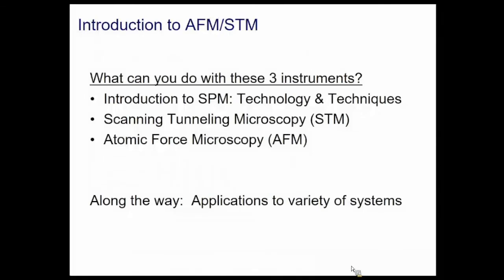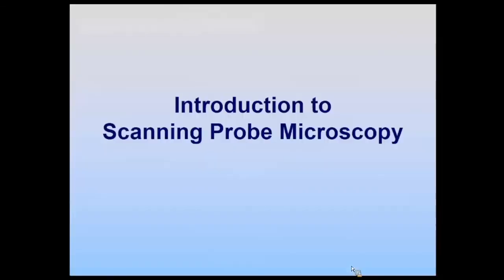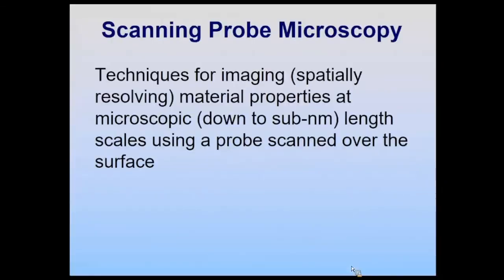For this talk, what I'm going to talk about is what you can do with these types of instruments. I'll start with a very broad introduction to scanning probe microscopy, and then focus on some specific techniques in STM and AFM with some examples along the way. Okay, so introduction to SPM.